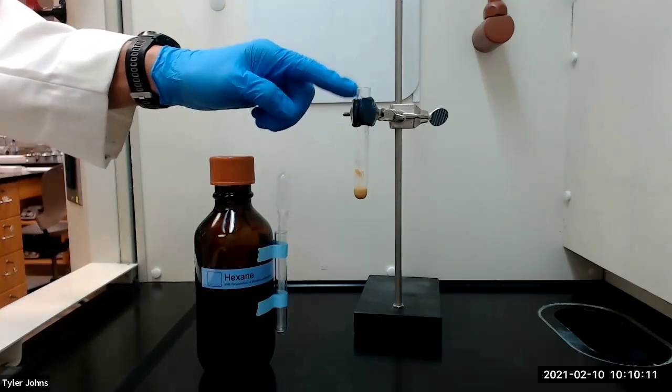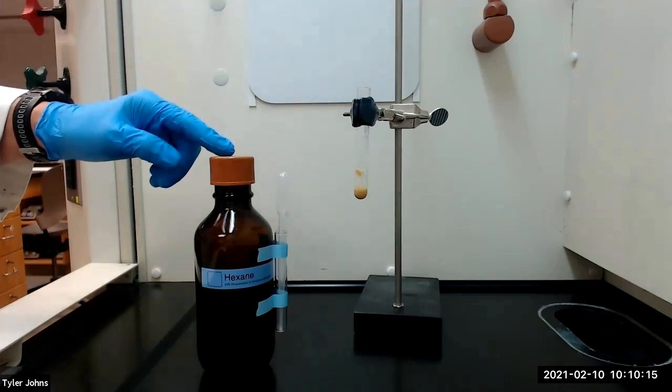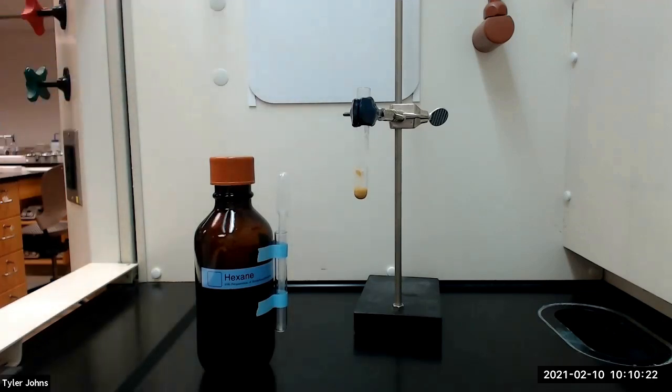After the heating period, we've allowed the test tube to cool to room temperature and we're next going to add four milliliters of hexane with stirring to dilute the silicone oil and any unreacted starting material.